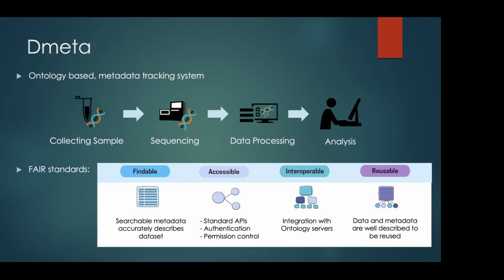So what an ontology-based metadata tracking system does is force the user to use the same wording for these definitions. In the future, when you do any analysis, for example choosing only RNA-seq data coming from lupus patients, all the RNA-seq data is going to be there for you.